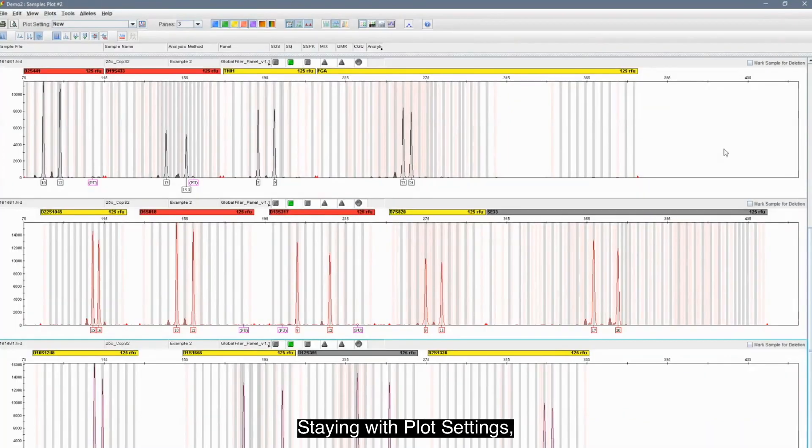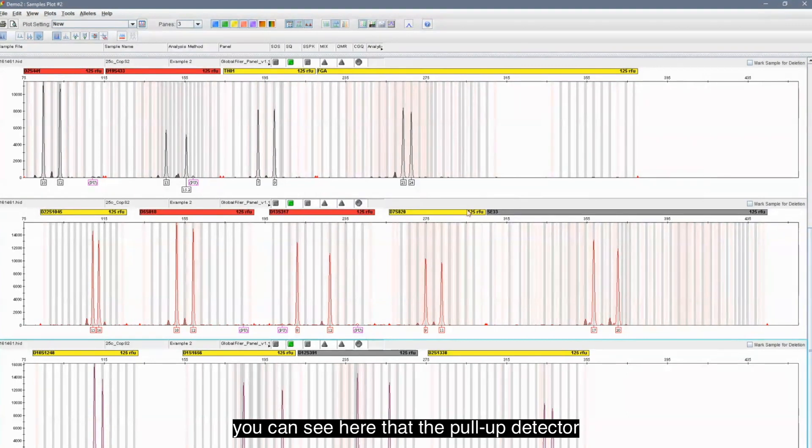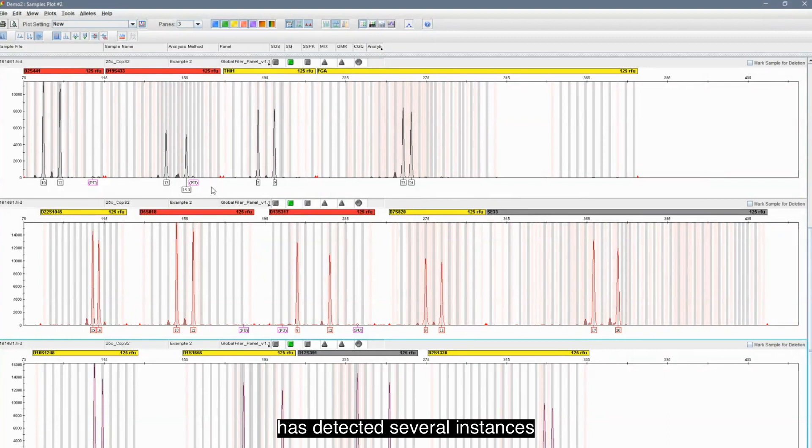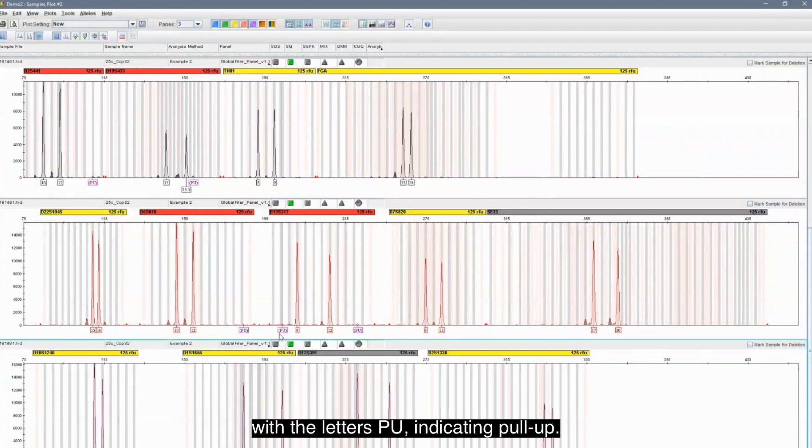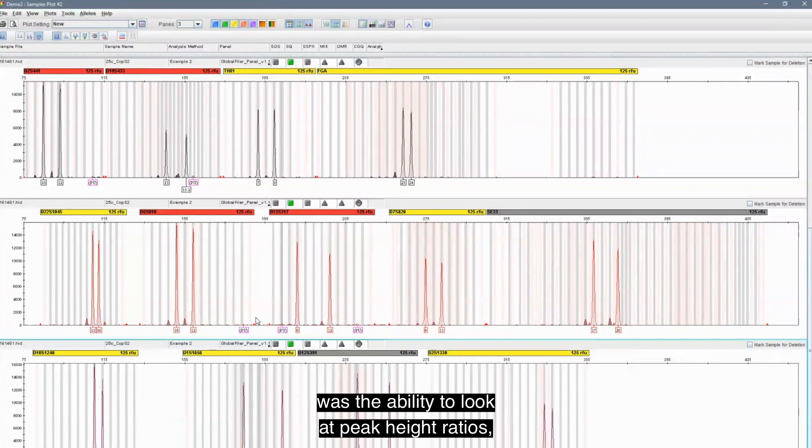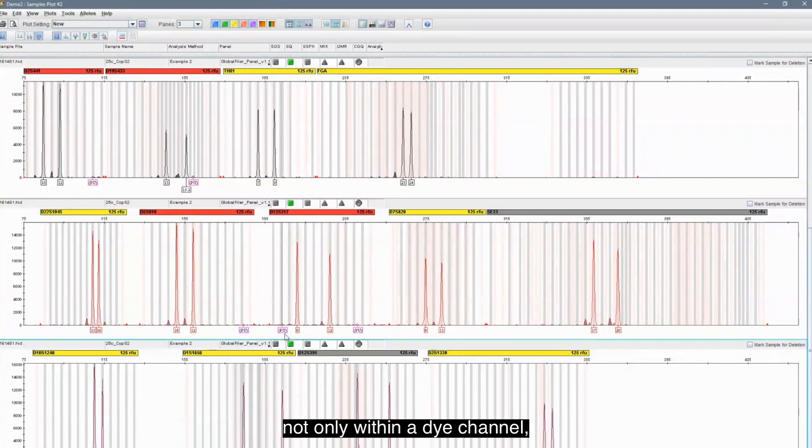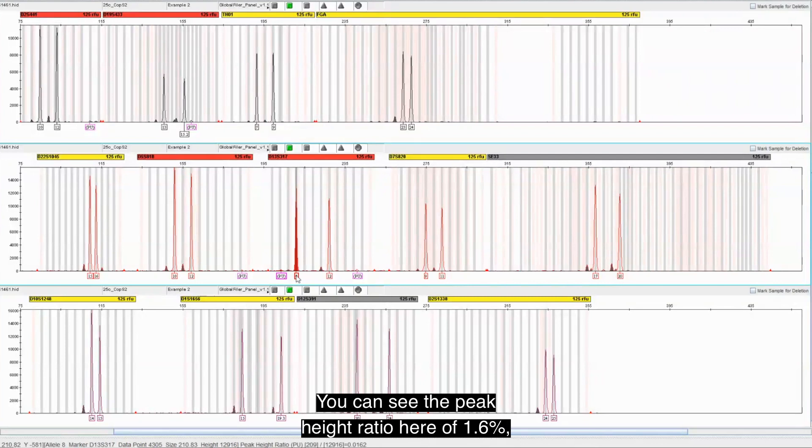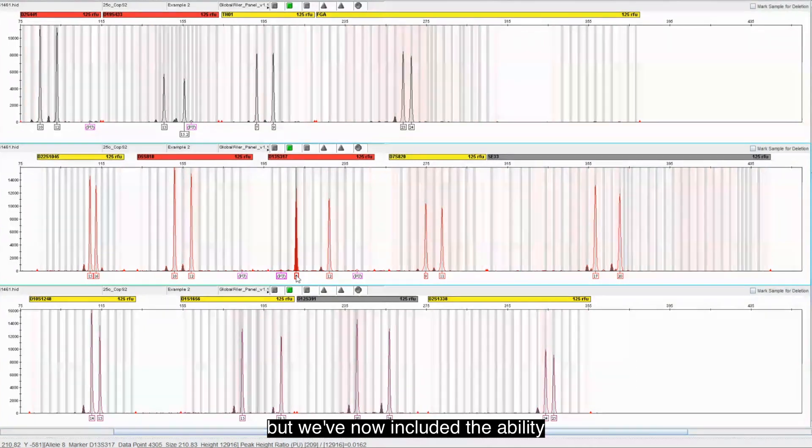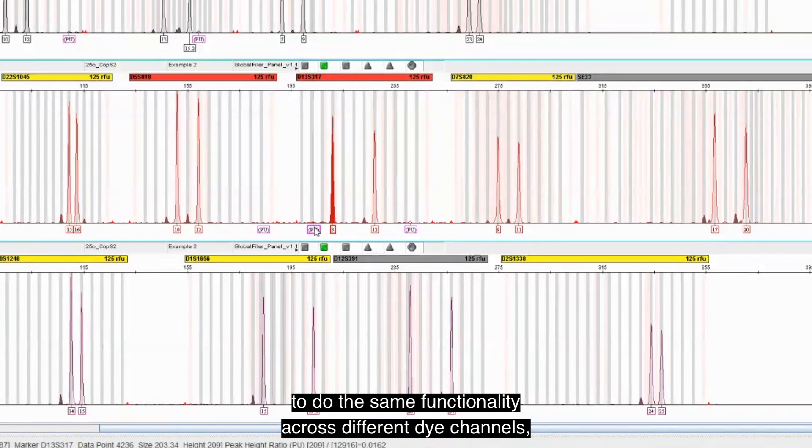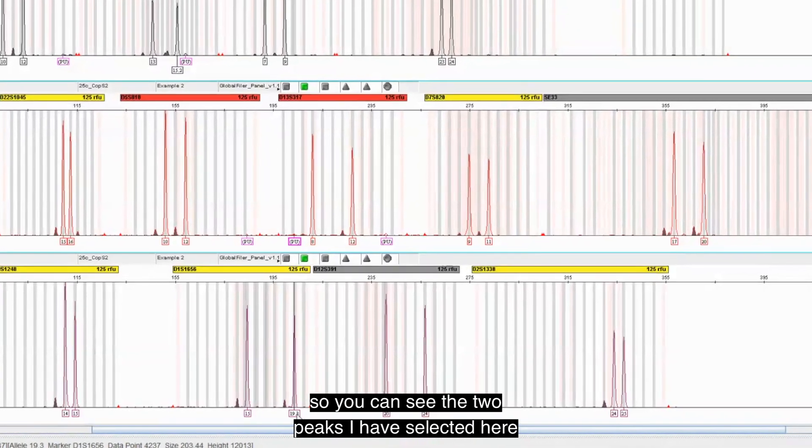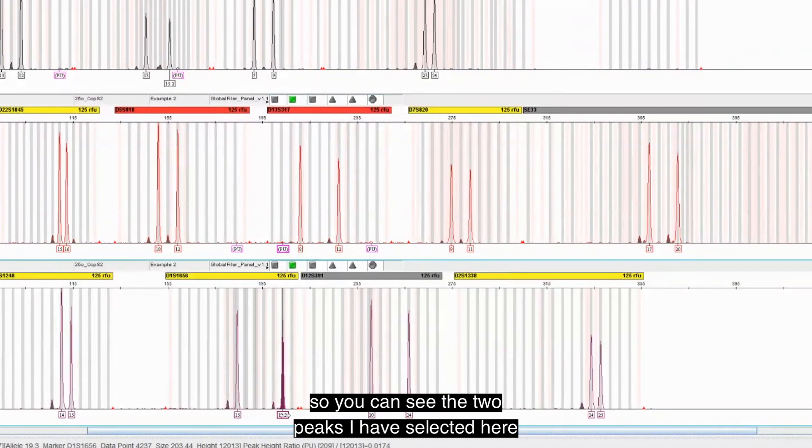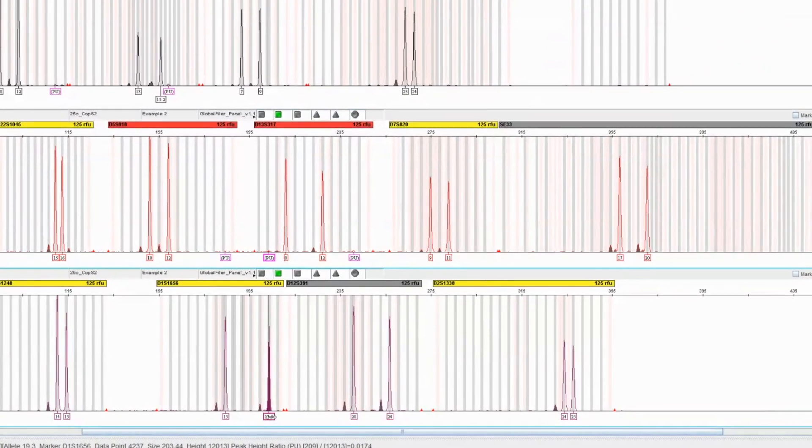Staying with plot settings, and if you remember back that pull-up detector that we set, you can see here that the pull-up detector has detected several instances of pull-up in our Electropherogram. And they are all annotated with the letters PU indicating pull-up. Also a new function in GeneMapper IDX 1.7 we heard from you was the ability to look at peak height ratios not only within a dye channel, which we all know we've been able to do for some time. You can see the peak height ratio here of 1.6%, but we've now included the ability to do the same functionality across different dye channels. So you can see the two peaks I have selected here have a peak height ratio of 1.7%.